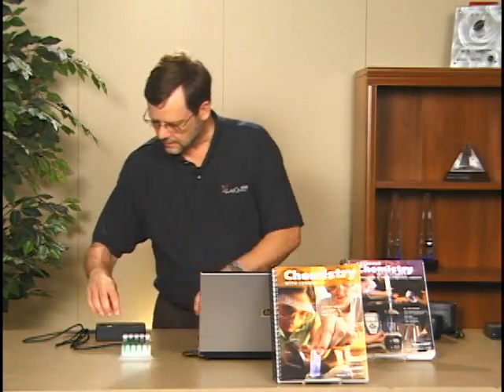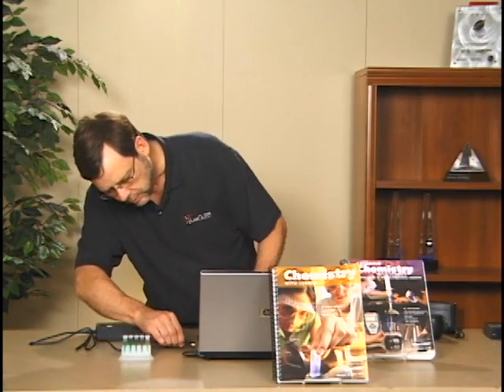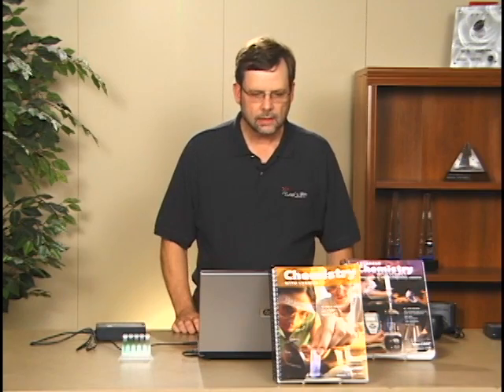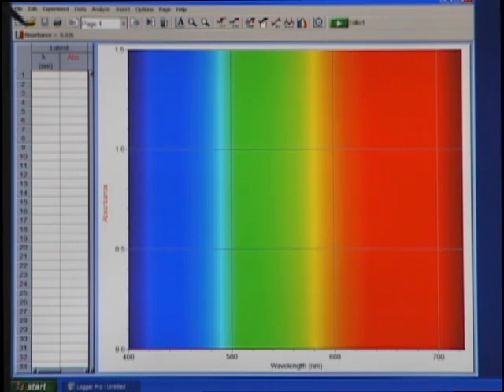So to start with, I'm going to take the SpectroViz spectrometer and connect it to the USB port of this computer. And when I do, it should get identified automatically here.